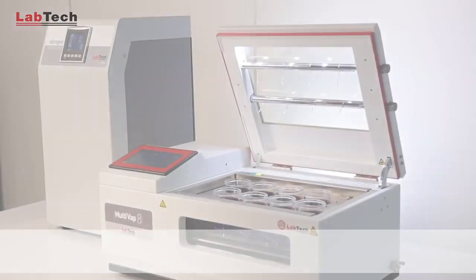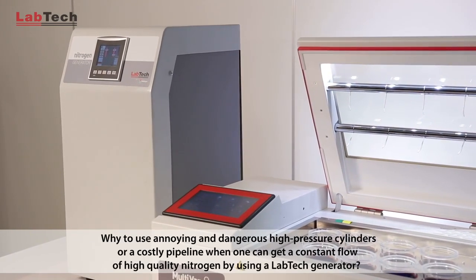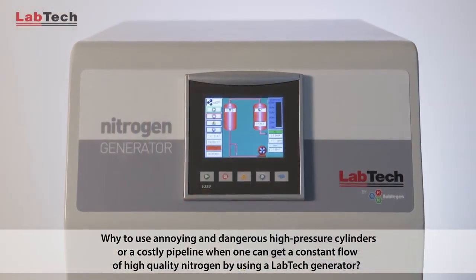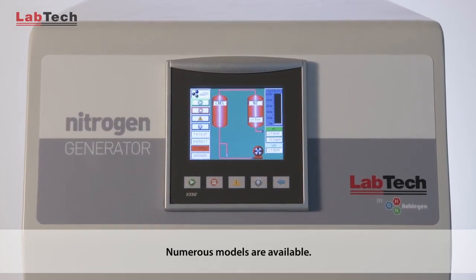A good automatic concentrator is nothing if not supported by a proper source of nitrogen. Why use annoying and dangerous high-pressure cylinders or a costly pipeline when one can get a constant flow of high-quality nitrogen by using a Labtech generator? Numerous models are available.